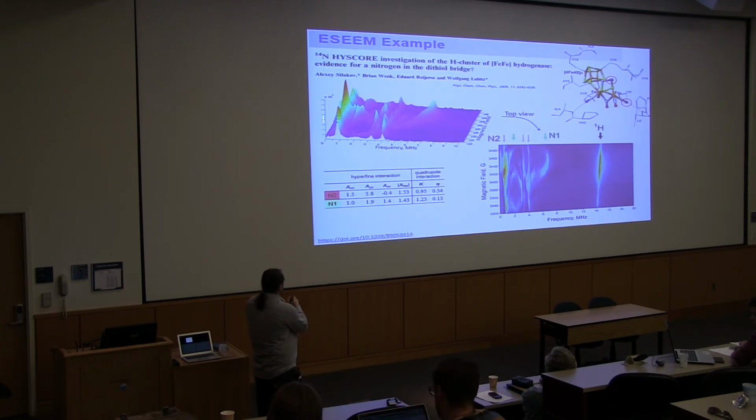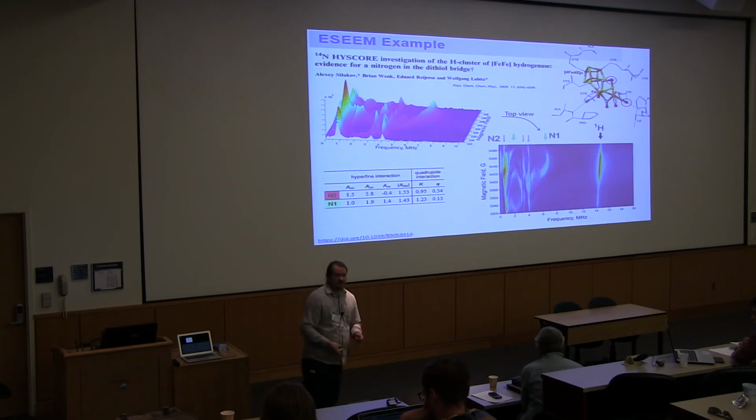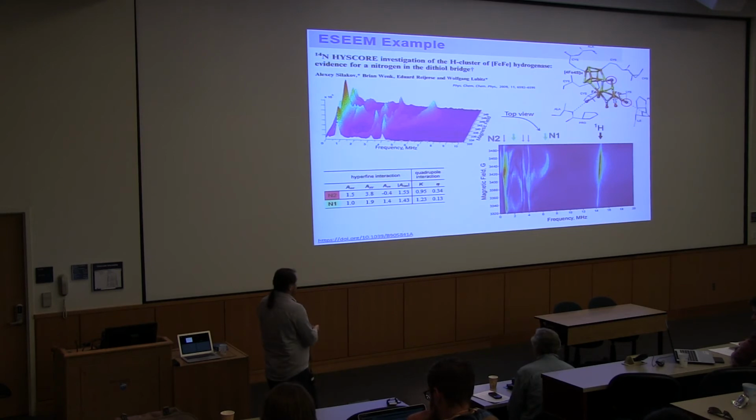You can also see here, for instance, protons and the Larmor frequency changing because we're changing the magnetic field. But from this complex pattern, we identified two different nitrogens, and they have very different quadrupole couplings. One of them was identified as cyanide, this proximal cyanide, as they call it.